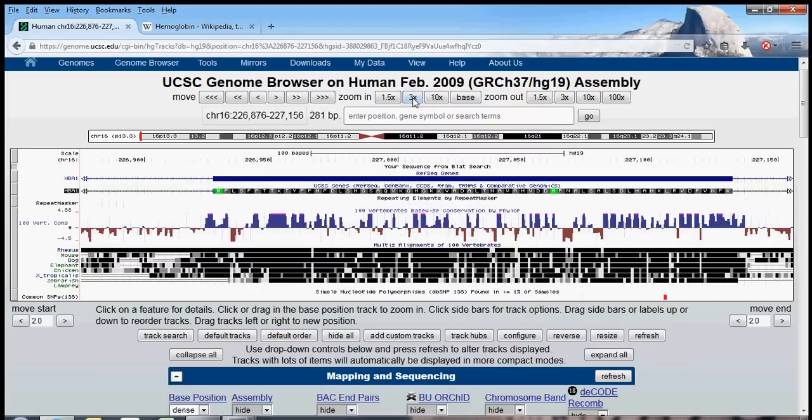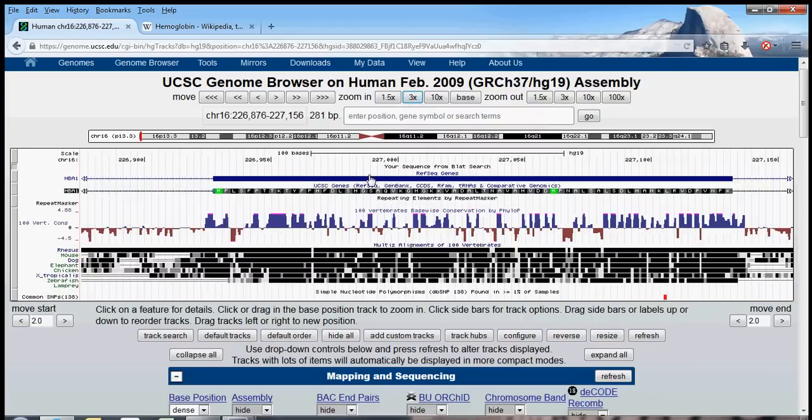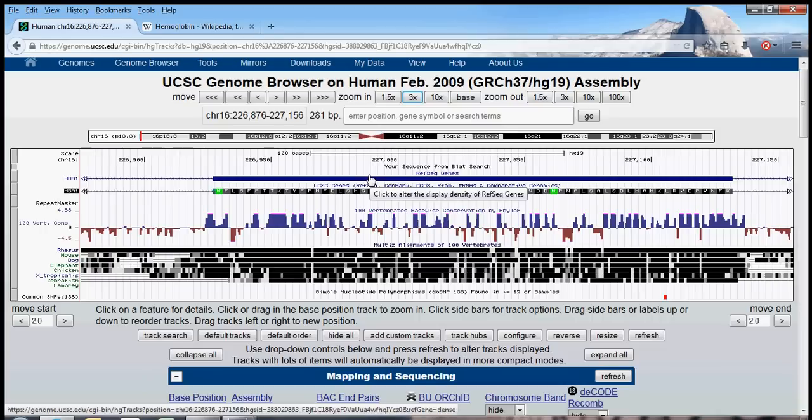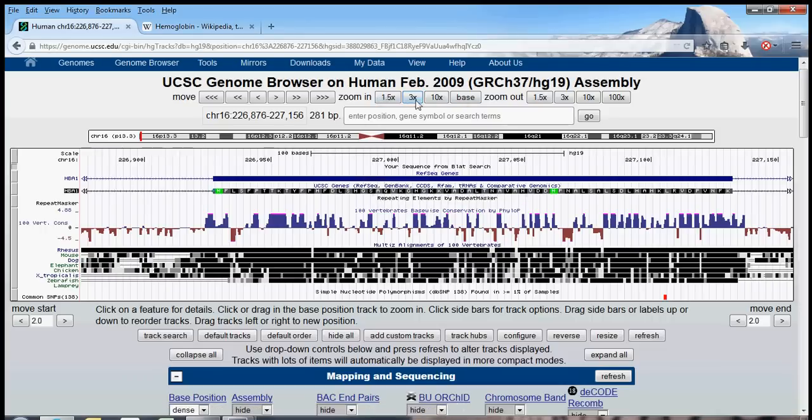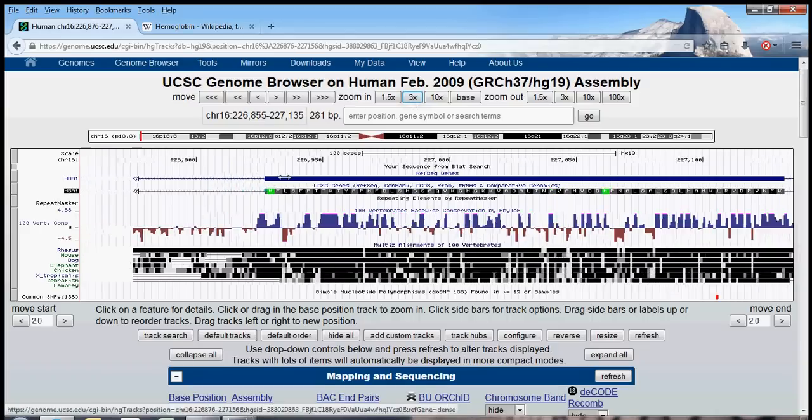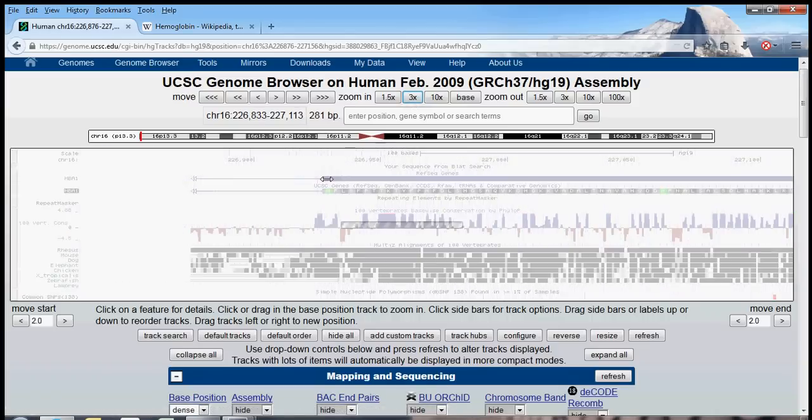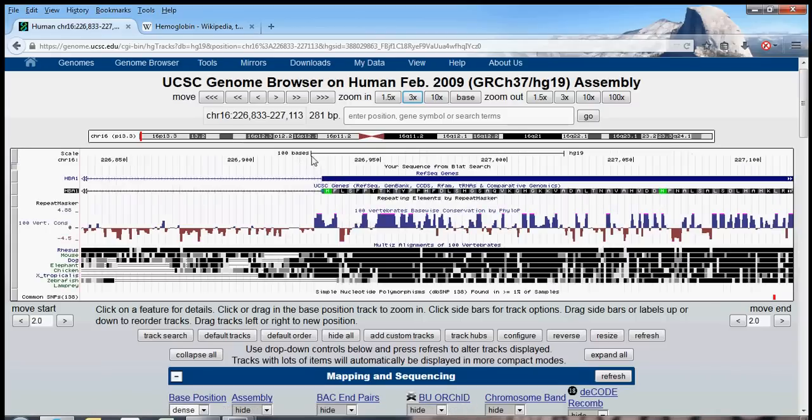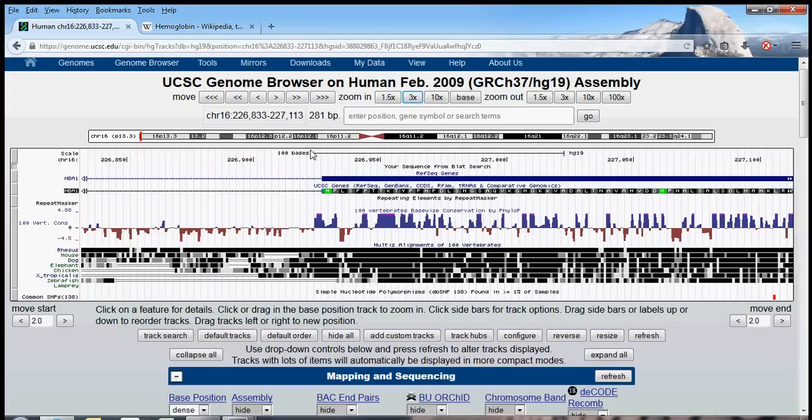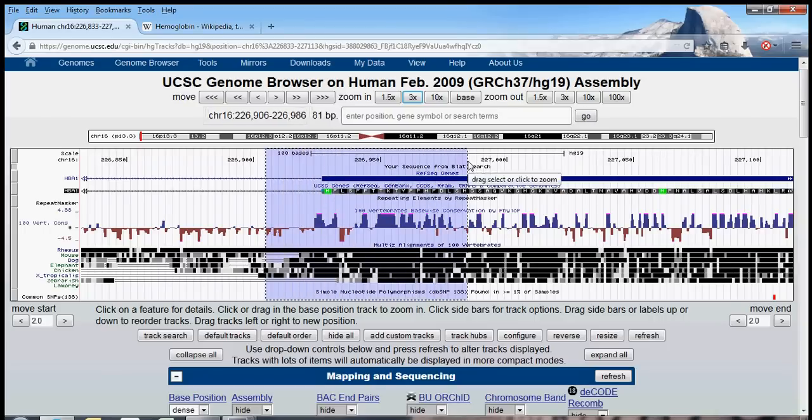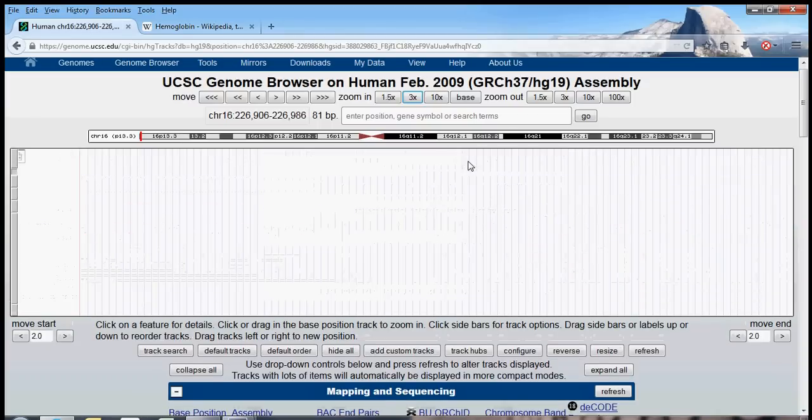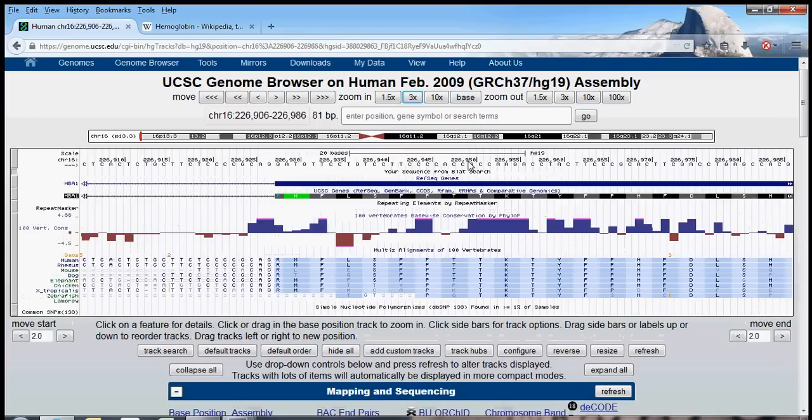Now, this is one of the, this is the second exon, I believe, and you can see that it's obviously larger. But, in addition to these buttons, you can slide the genome browser that has the same effect as moving it. Or, you can highlight the area that you want to zoom into, and it will zoom in.